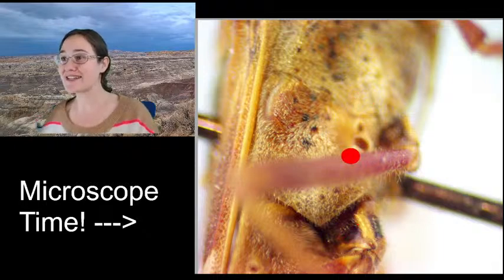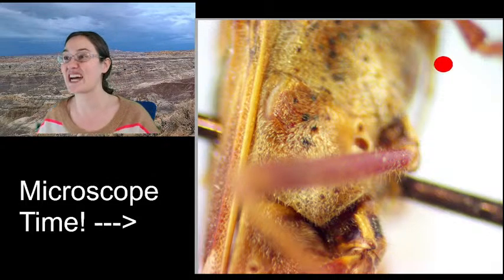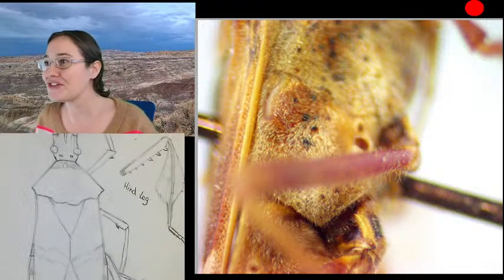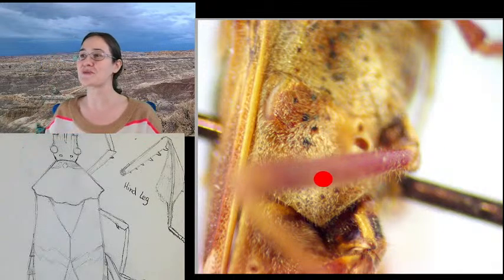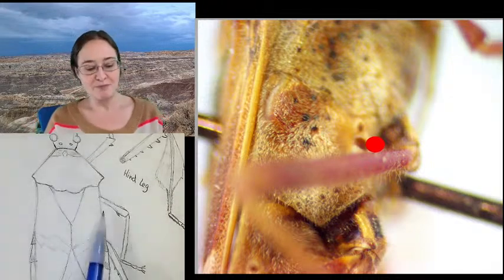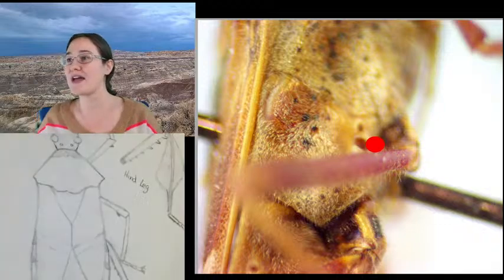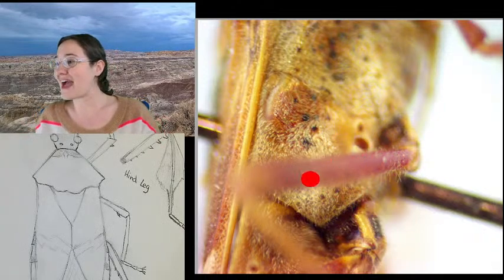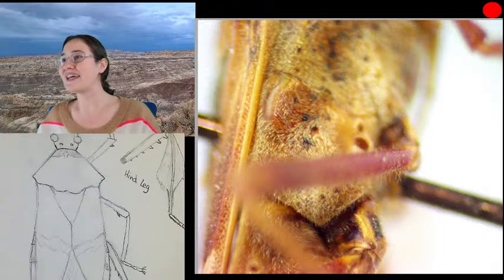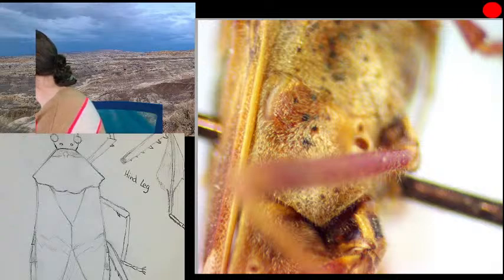My leaf-footed bug does have a scent gland, meaning it does have the ability to release a toxin that doesn't smell good, doesn't taste good. And if you are wondering where that is coming from, you can see this little itty-bitty hole right here that's right above the middle leg. That is going to be where the scent gland is. So if we're looking at that on our specimen, it's going to be kind of underneath right about here, but it's going to be right at the base of our middle leg. And he will have that on both sides. All right, so that's going to be where our stink comes from. And I wanted to make sure that I could see that before I answered your question about his stench.